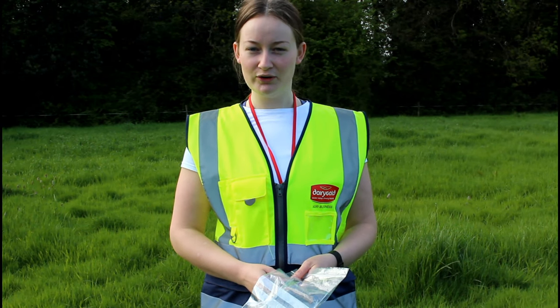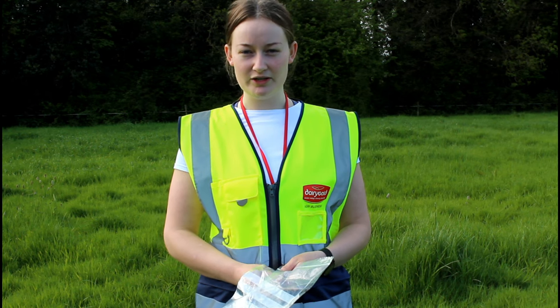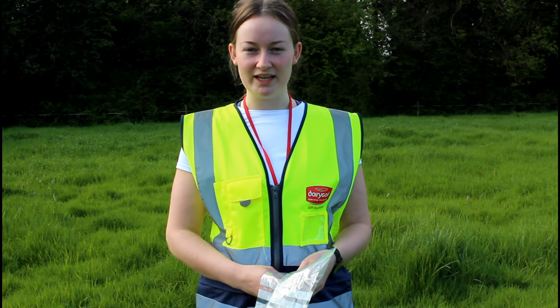Good quality silage starts with good quality grass, and here at Dairy Gold Analytical Services Laboratory in Lombard Sound, we test grass. Today I'm going to show you how to take a grass sample.